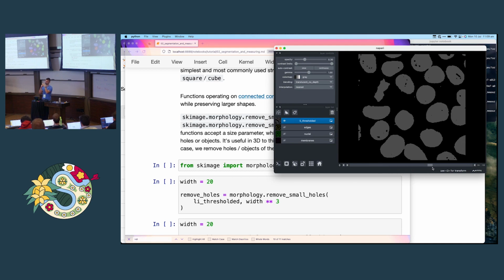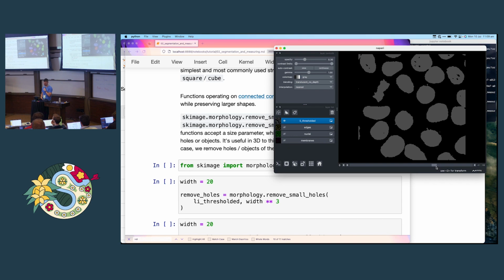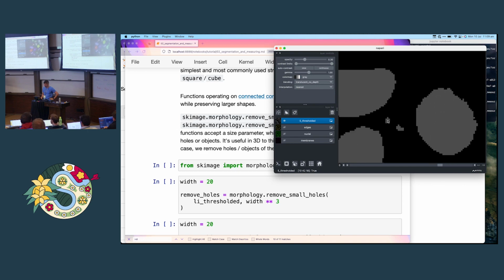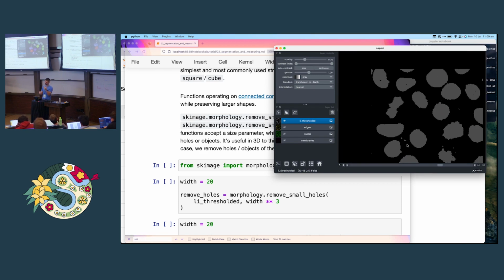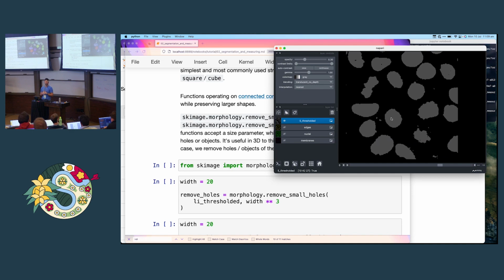So they're just normally hidden on the inside. You have to say ignore depth in that labels image so that you can see the points inside. You can see that there are a ton of points per nucleus, and then if we do a watershed from those points, you're just going to end up with tons of different labels for each nucleus, and that's not what we want in our segmentation.